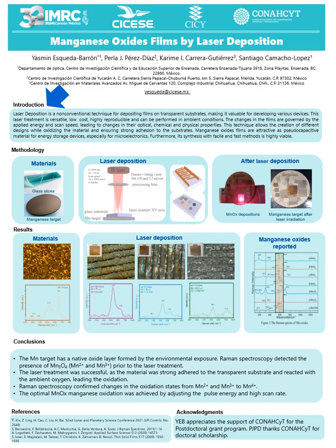The technique we propose in this work involves transferring material from a target of interest to a transparent substrate under ambient conditions. This process takes just tens of seconds and is low cost. The characteristics acquired by the material after deposition can be primarily attributed to the power parameters and scanning speed, as well as the rate of interaction with ambient oxygen. These changes are evident in the material's optical, chemical, and physical properties.